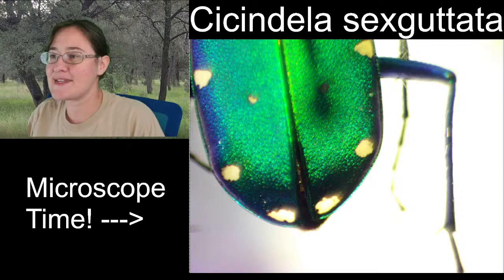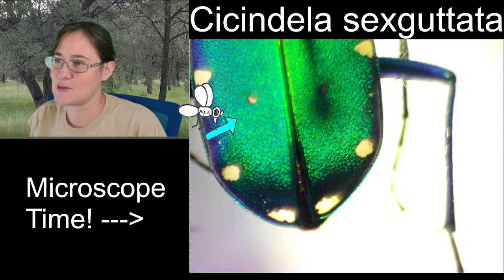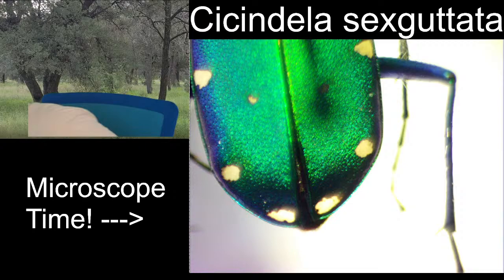And this specimen here, its wings are just slightly open, but a lot of times they are closed all the way. And when we zoom in, we can see that there might actually be 8 spots, because there's a little white one here and another little itty-bitty white one there. So there are 6 large white spots, but we've got 2 little itty-bitty spots also, that I guess we could only see when we're looking at it under a microscope.